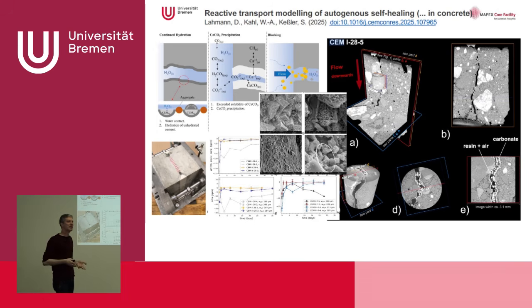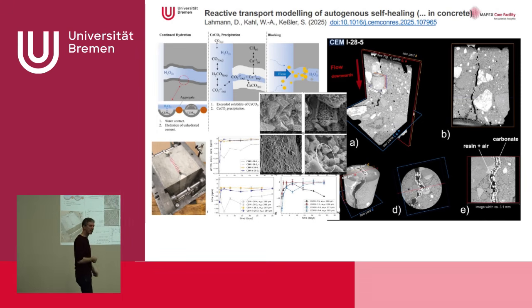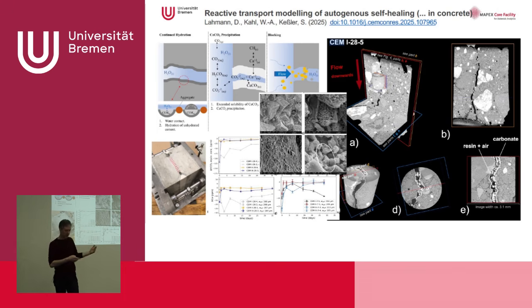And so there are several theories. How does the self-healing process of the concrete really happen in the sample? They made experiments. They measured the water throughput in the lab, and then they saw it ceased. And that was the interesting thing. Which of these theories was actually true? Of course they investigated with SEM and stuff like that. And then from this big block we took several samples from several heights, and then we decided which of those to scan.